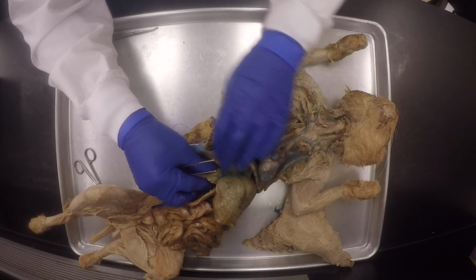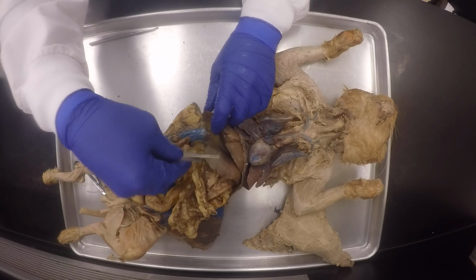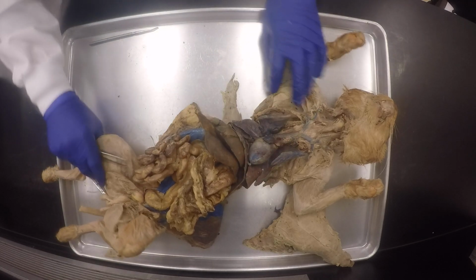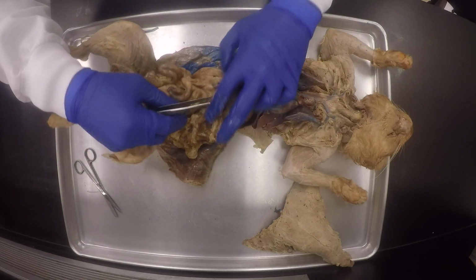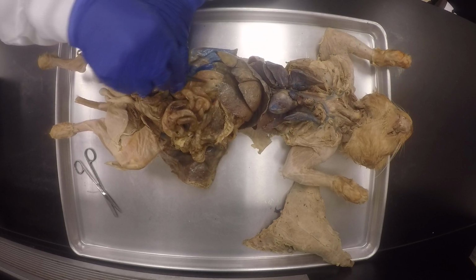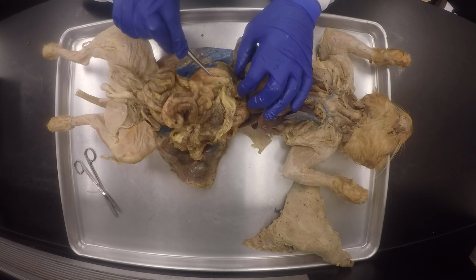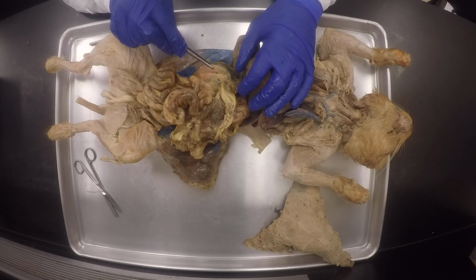So right lateral lobe, right median lobe, left median lobe, left lateral lobe, caudate lobe, and you're done for the liver for the cat. Okay, and then we go to the first part of the small intestine, and I will always have it close to the pancreas, right? That we just identified. So I'll ask, what is that part of the GIT? Then you know to say duodenum.